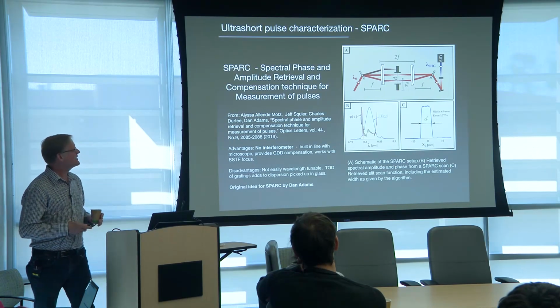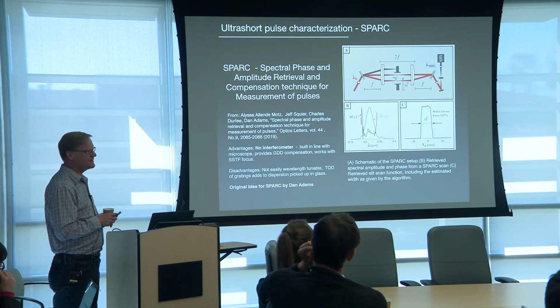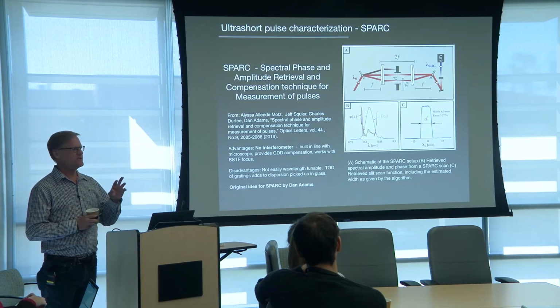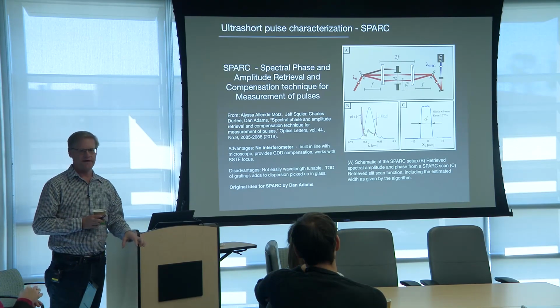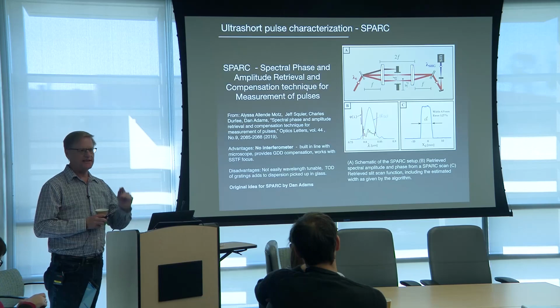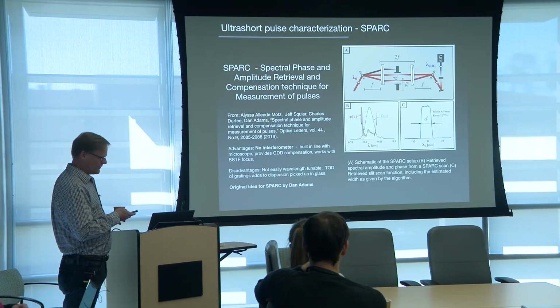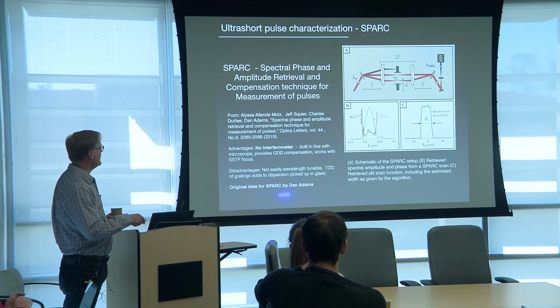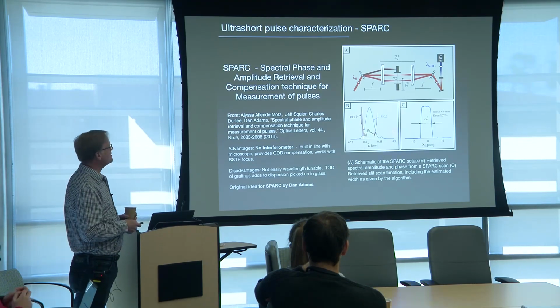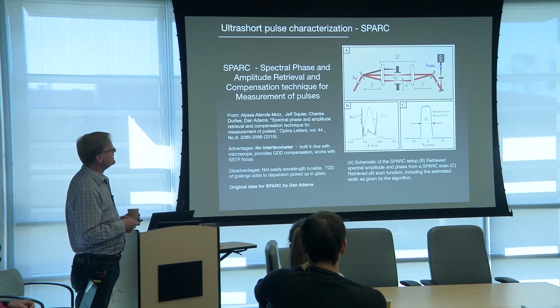Okay, but this is where the new stuff hits, where I've kept in mind what we could do to still facilitate the dual challenge of providing dispersion compensation for the microscope, but enabling you to do a pulse characterization at the focal plane of your microscope simultaneously. And we finally came up with a cool system, and this was actually the original idea by one of my colleagues, Dan Adams. The idea is pretty simple: we set up a grating and we image it back onto a second grating.